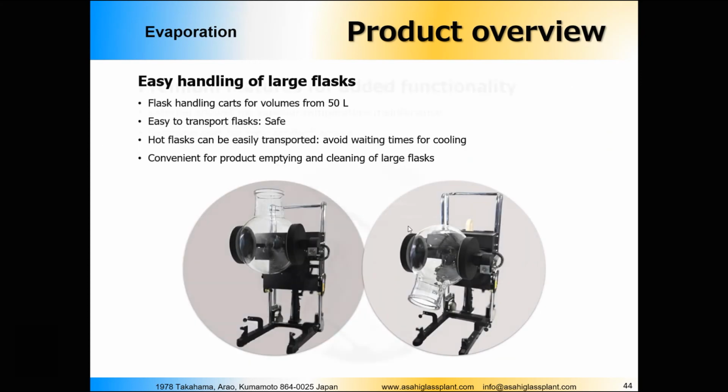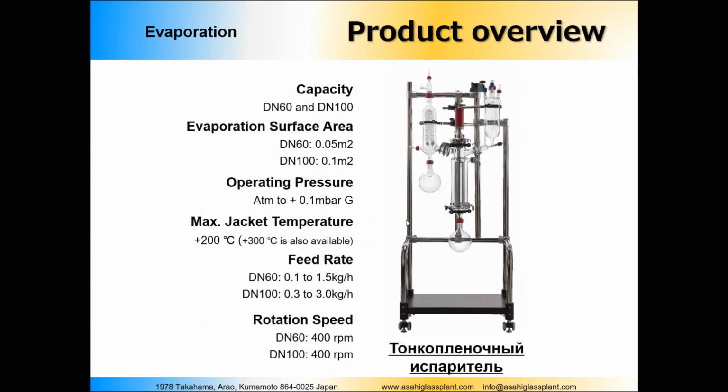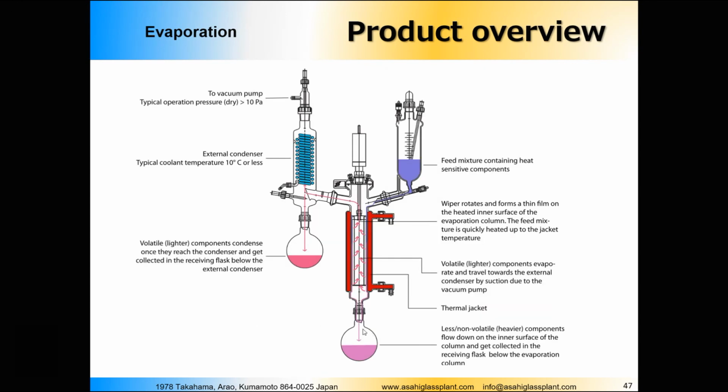There is another way of evaporating till dry. Well, let's get back to this slide. So the advantage is also a disadvantage. Why? Because we cannot evaporate till dry. If you evaporate till dry, then the dry substance will form on the walls. First of all, it won't fall down. Secondly, it will start to decompose on the walls.